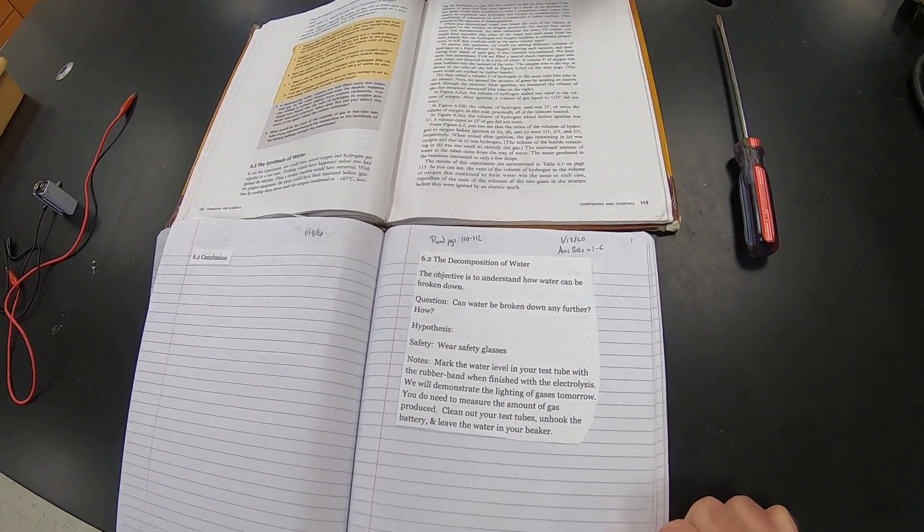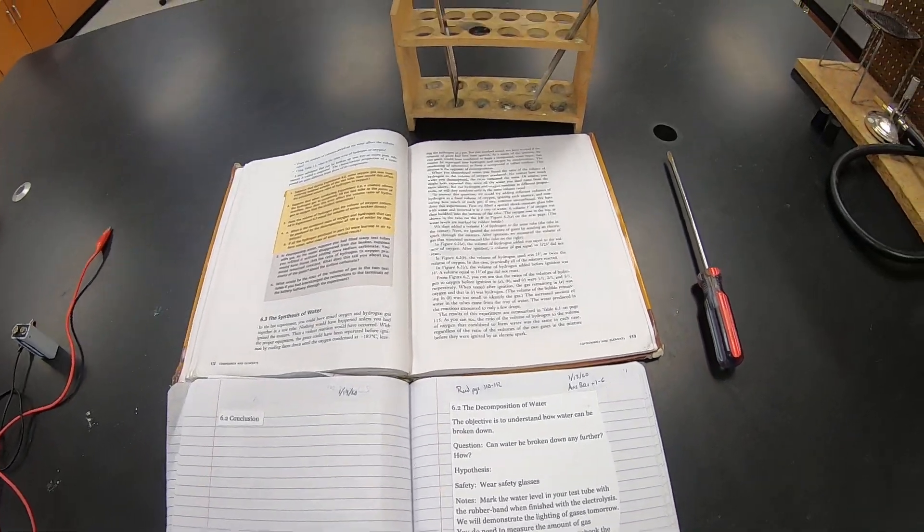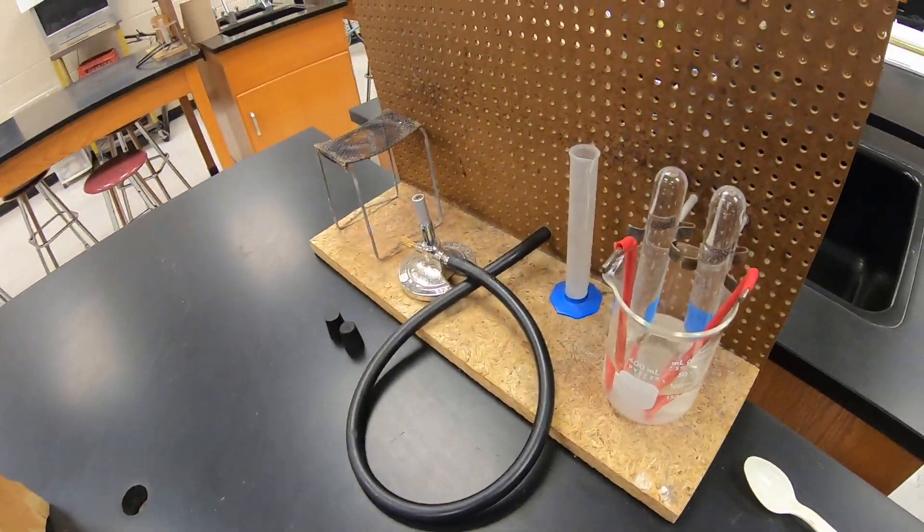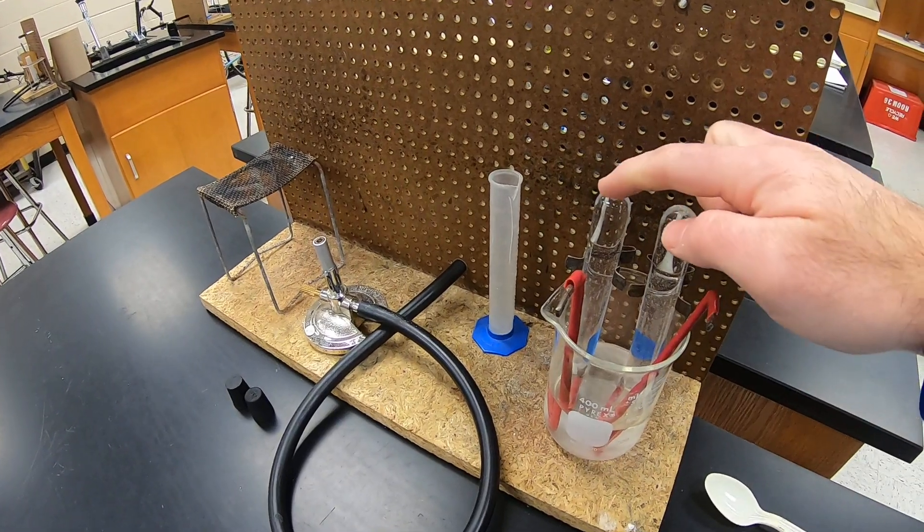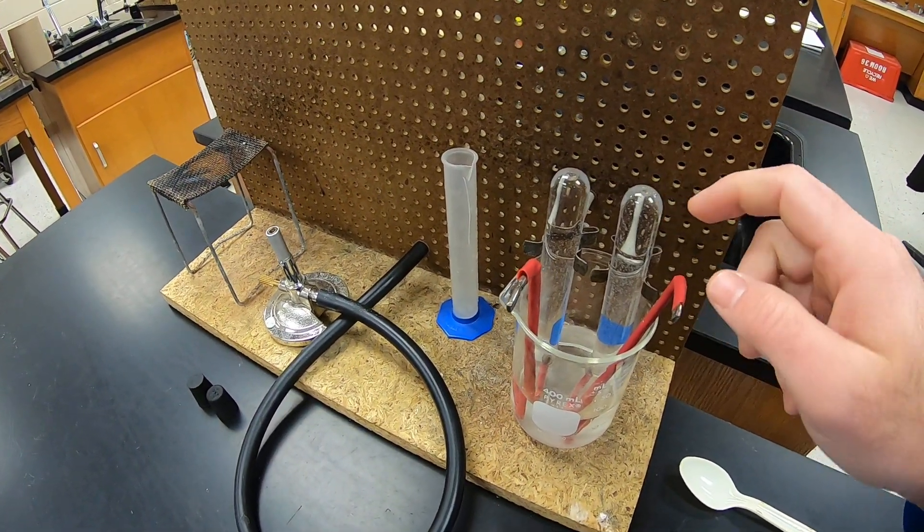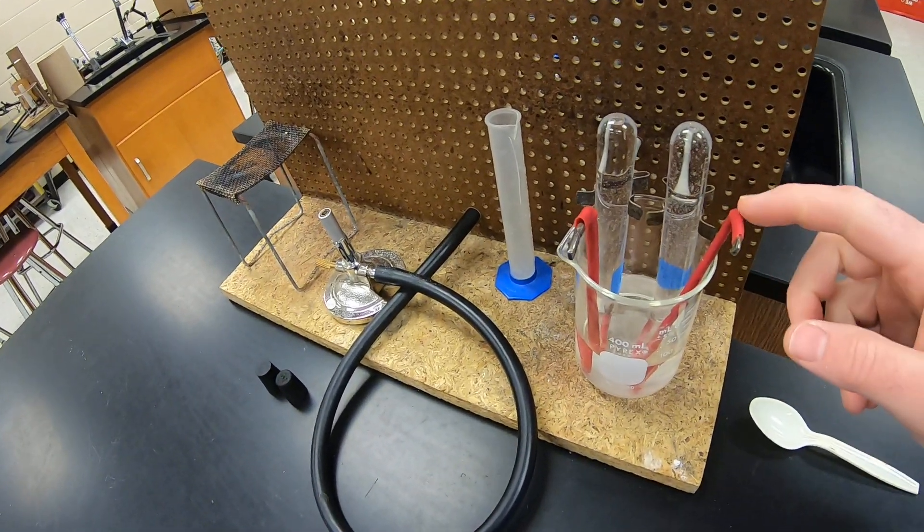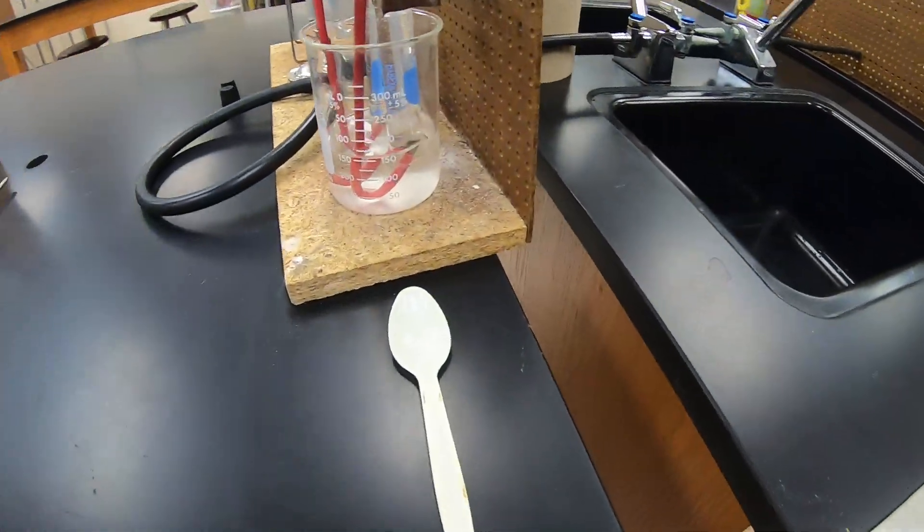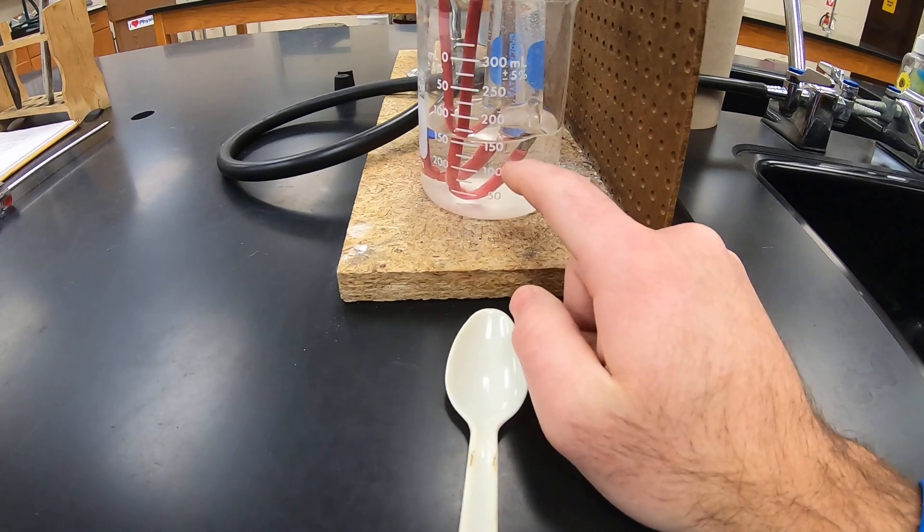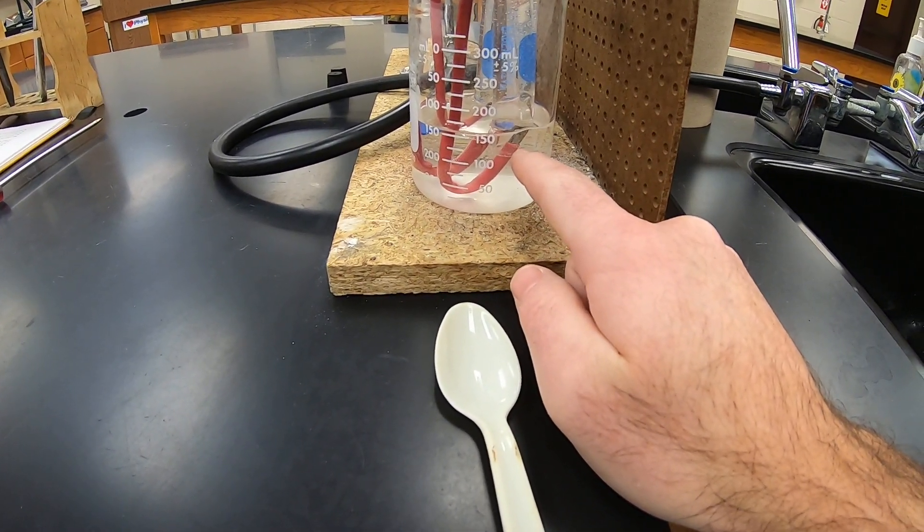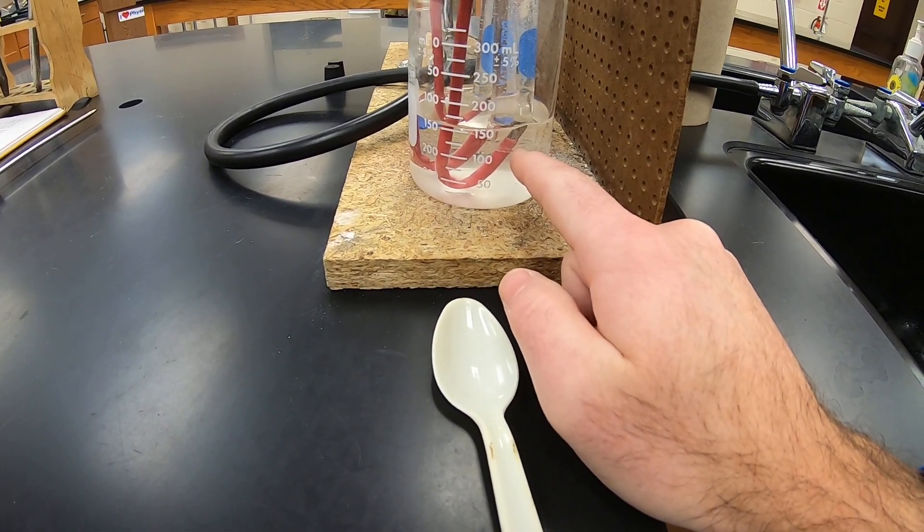We're going to do this video in two parts. So we've already got this set up. I've got two test tubes. Both test tubes are completely full of water. There's a little bit of air in there because I let it sit overnight. And we've got two electrodes, and you can see that the metal part of the electrode is actually in the test tube. The test tube covers it.